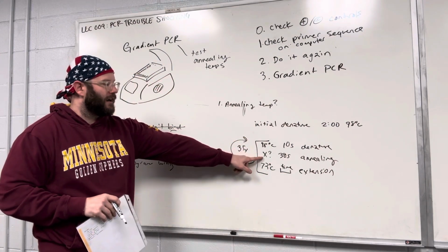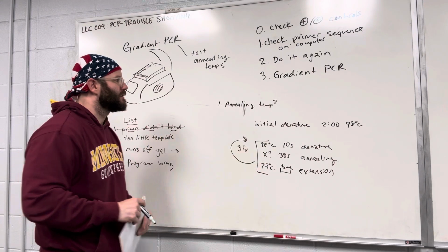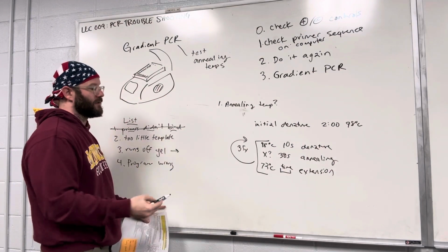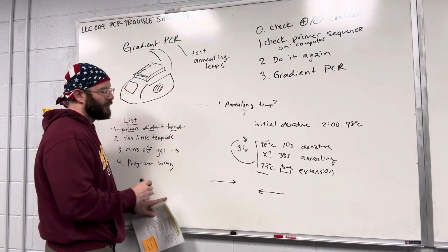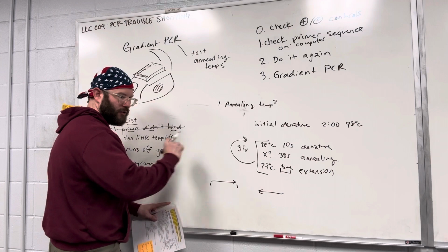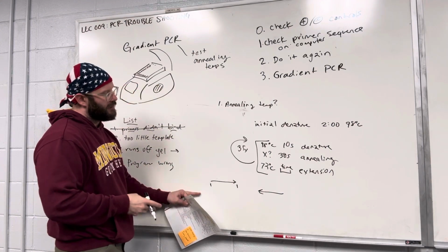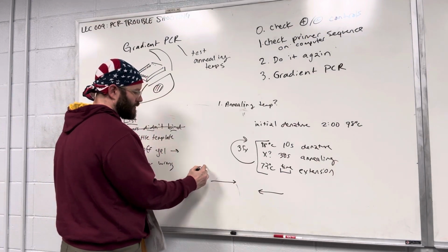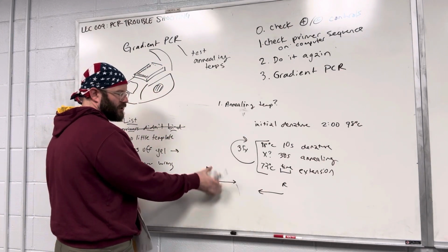How do you find that value? The number of base pairs in your primers. Yes, so it's the A's, T's, G's, C's in your primers. So there is a computer algorithm, which I'll show you later in the next module, where you just take your sequence, you put it in the computer program, it looks at the A's, T's, G's, C's, it tells you what the annealing temperature is. But because there's two primers, so you usually have a forward and a reverse, we should talk about this.